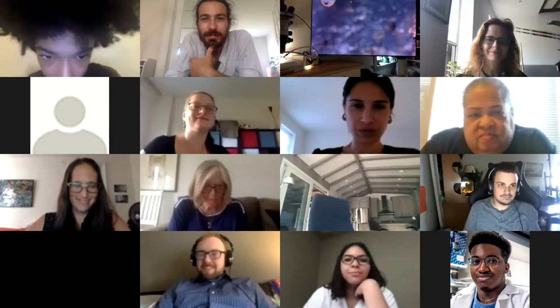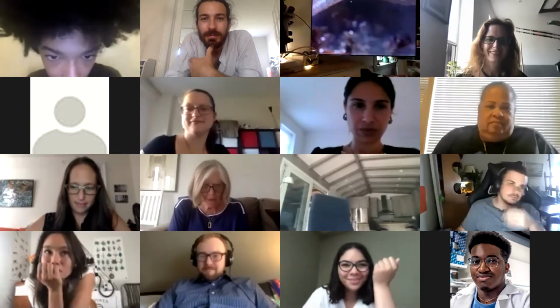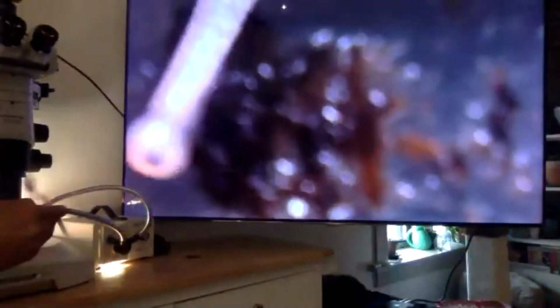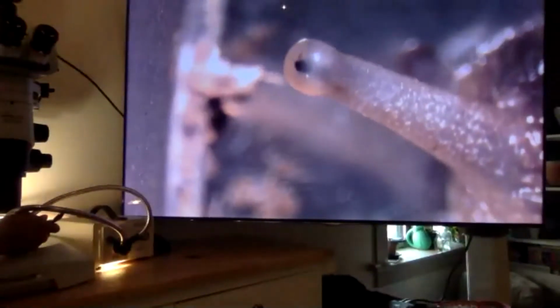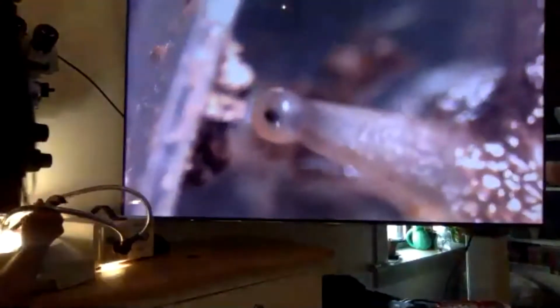Oh, look at that eye though. Okay, come here, friend. We're gonna do an experiment. Okay. Oh, there's an eye. Throw a thumbs up every time you see an eye. Ready, set. This is tricky. This is a very active snail. He's probably trying to get away from this lady that dropped me. And Jeff in the chat suggested that it's possible it's evading the light because it thinks it will dry out. Ah, that's a really good idea. So in a way, we are seeing it respond to a stimulus.